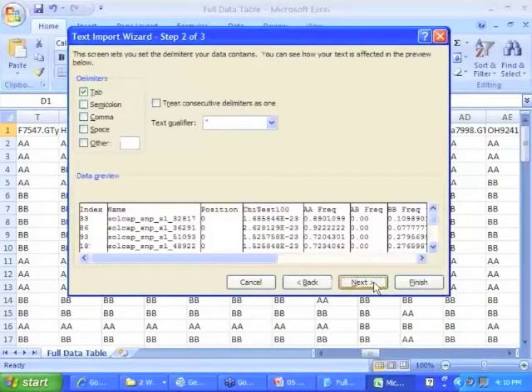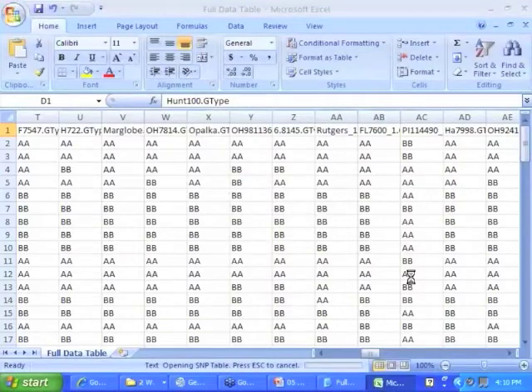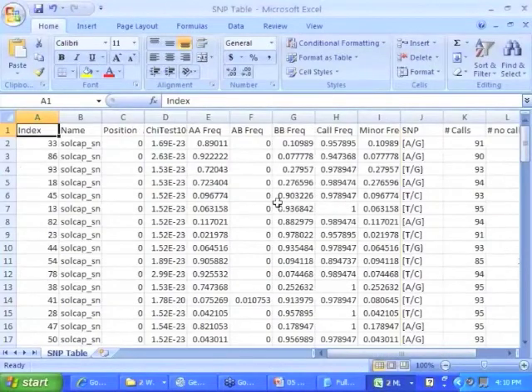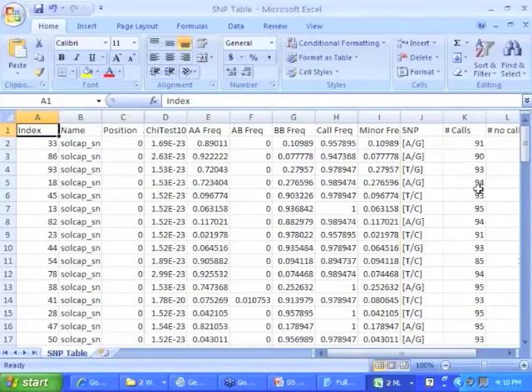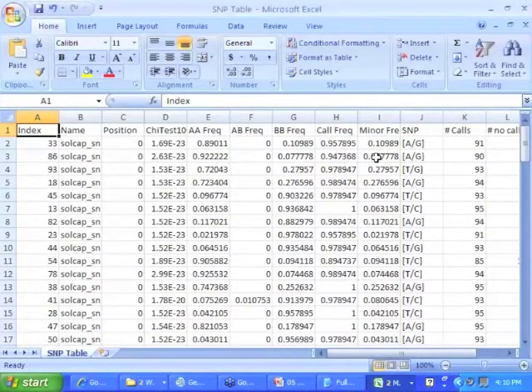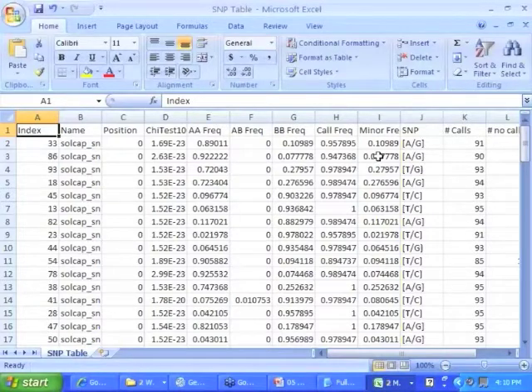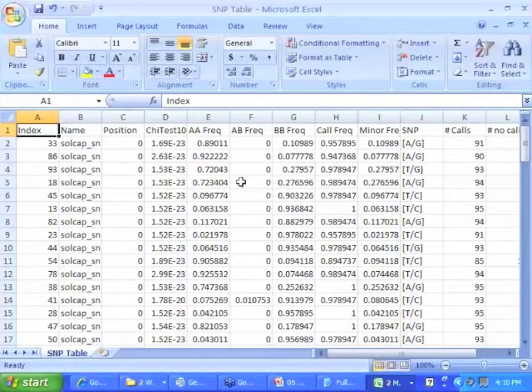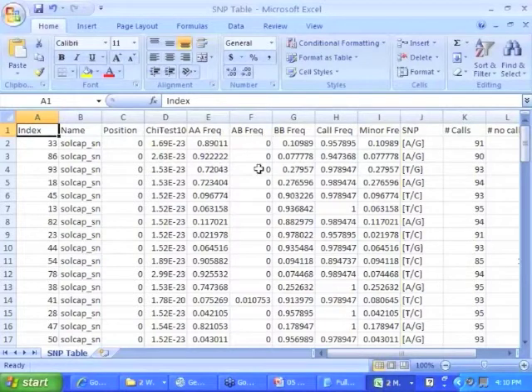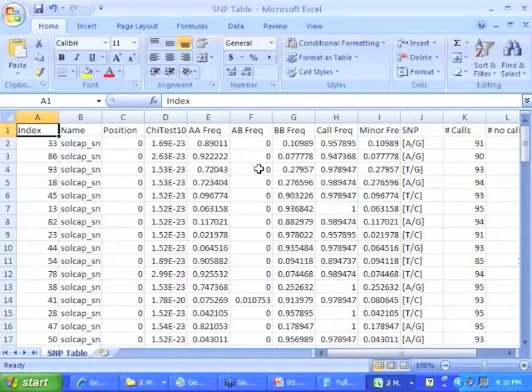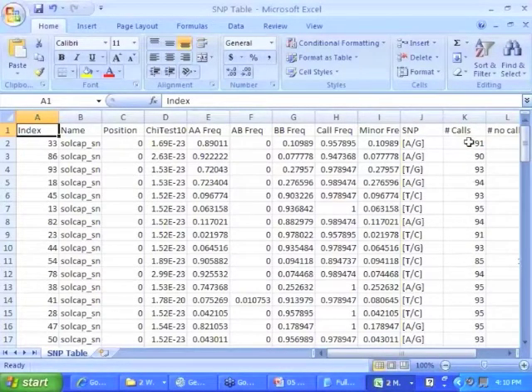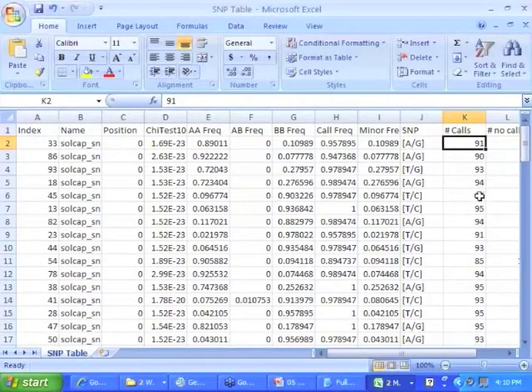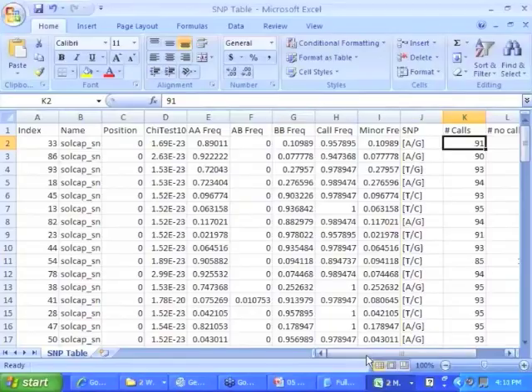The index, as long as it's sorted the same, I didn't sort in between. As long as it's sorted the same, I could append that and have these statistics beside, and I could sort by that. So that's what I would do. I would actually append, copy this table, put it at the end of the genotype table, and sort on these statistics. I'm interested in only SNPs that have an allele frequency of 60-40, because I have a mapping population, and that's what I expect. I only want SNPs that have at least 90 calls. So do sorts like that, and things like that for quality control.